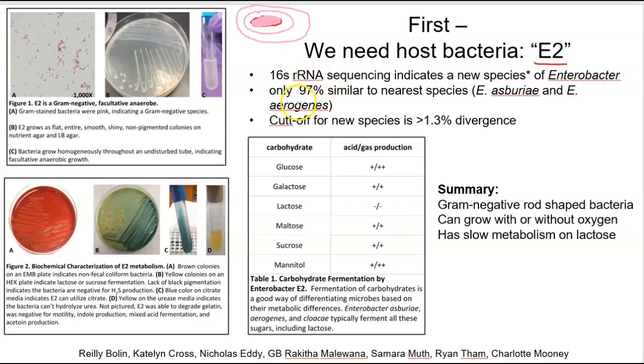And with this bacteria, the first couple tests you do, a gram stain, and that sort of breaks the bacterial domain into two main groups, your gram-positive and gram-negative. And of course there are exceptions, because in biology there's always exceptions. But that's a good test to start off with, and then you start looking at its oxygen requirements. So we're trying to narrow down what this new organism is.